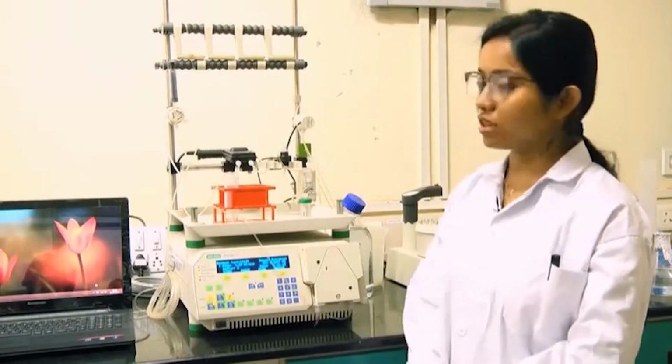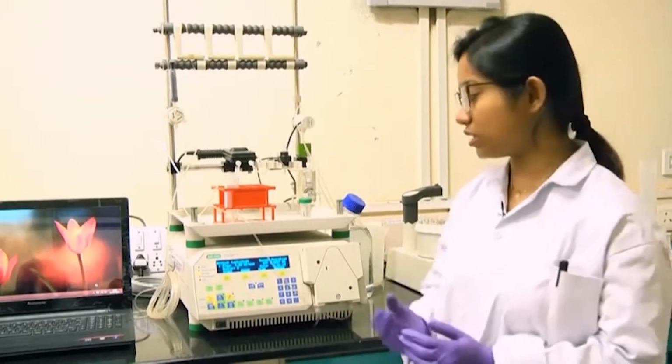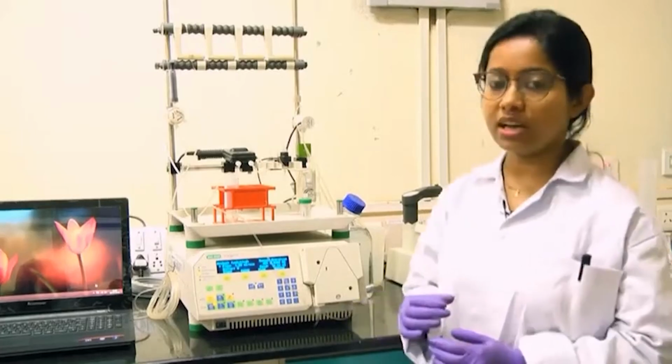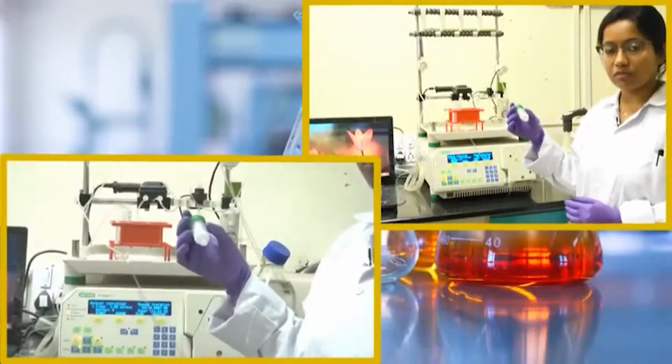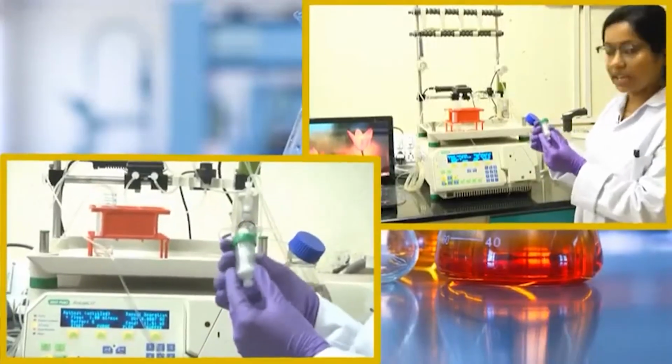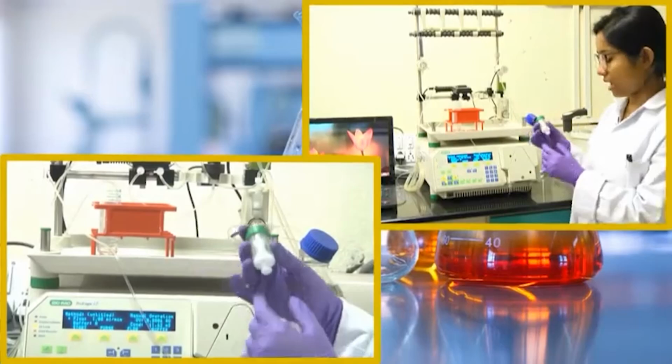In our case our protein is 6x histidine tagged. It has 6 consecutive histidine molecules at the N terminal of the protein. So, we can easily separate our protein from other residual proteins of the cellular components using a Ni-NTA column. This is the Ni-NTA column, which has nickel beads attached to the NTA agarose beads.